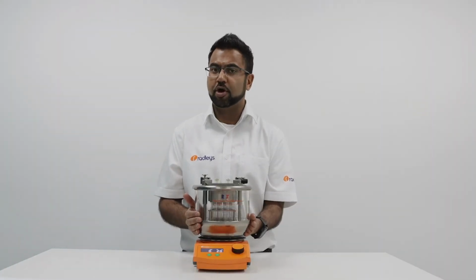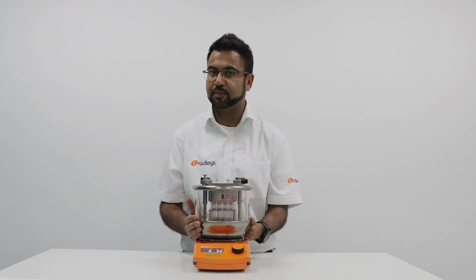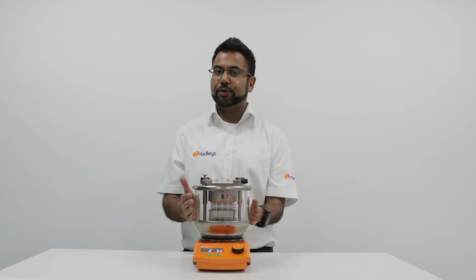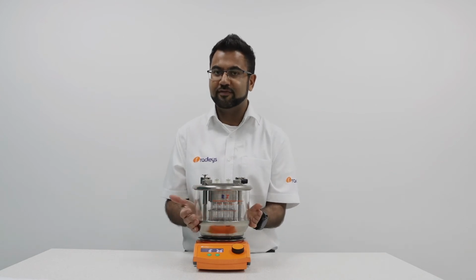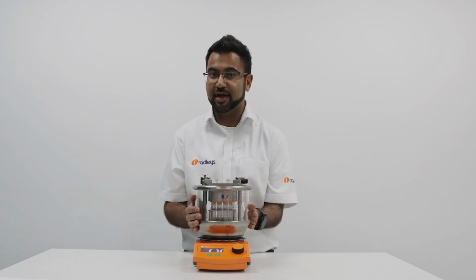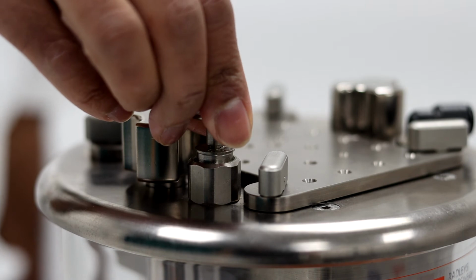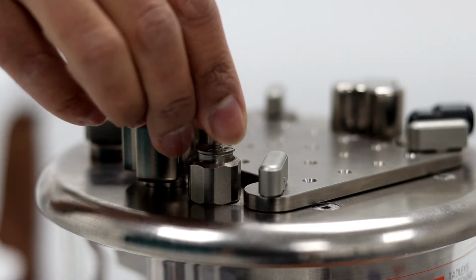To ensure you do not overpressurize your GreenHouse synthesizer, it's best to have a regulated gas supply going into it. We recommend pressures of 0.5 psi to 1 psi if you're going to perform reactions under an inert atmosphere. If you do overpressurize your GreenHouse system, we do have this pressure relief valve on top.